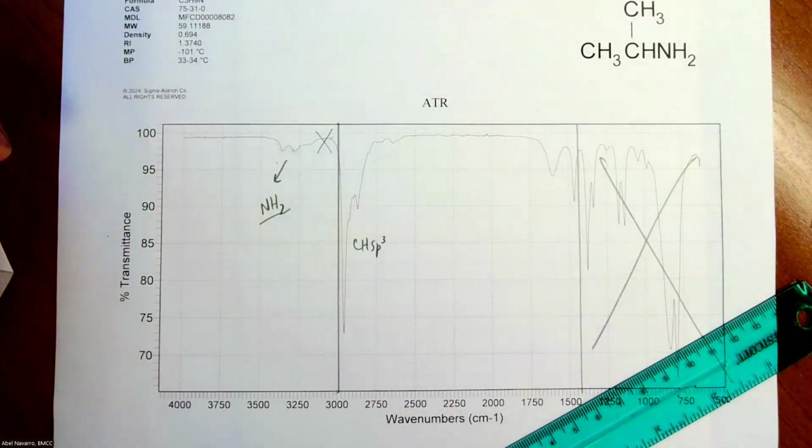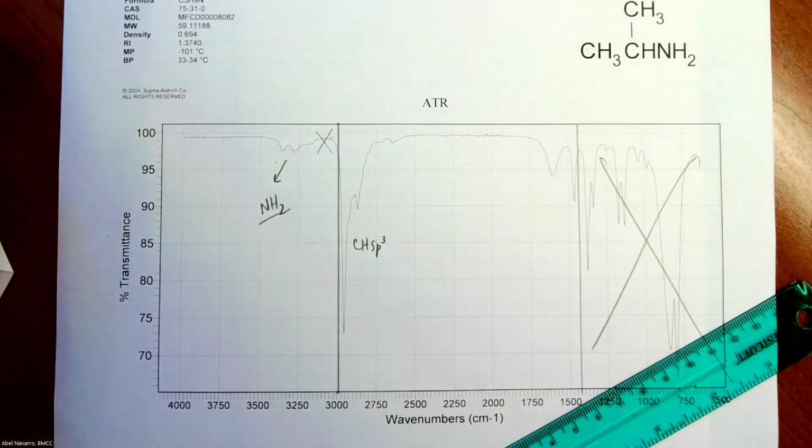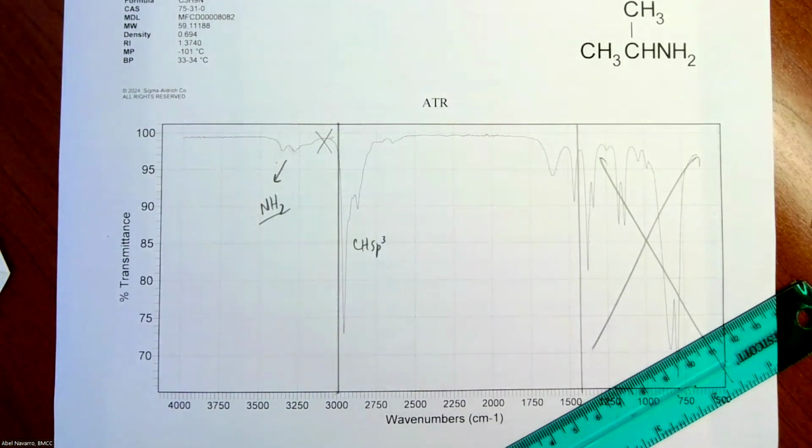Professor, that's kind of tricky because that one is almost noise. Unfortunately, once again, IR is IR, so it gives you a signal, even if it's very, very small, but you have to be very careful with the signal reading. I know that, and this signal is totally different. This one is way more obvious, right?